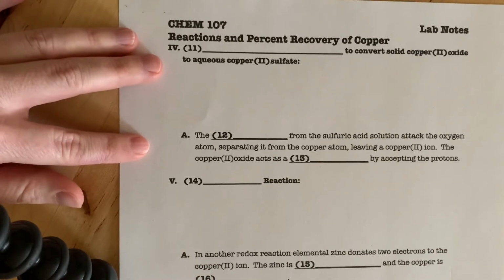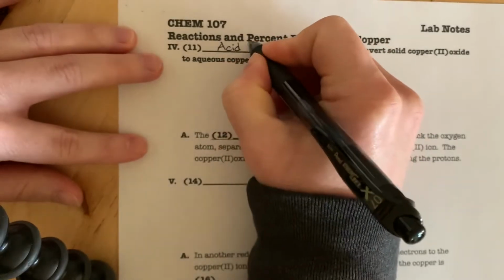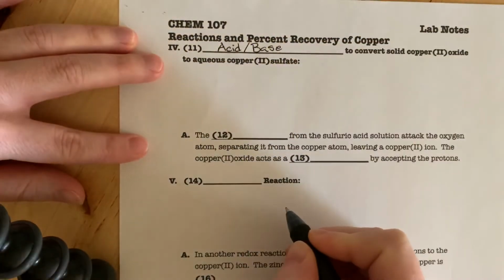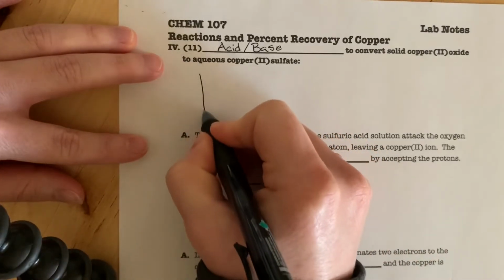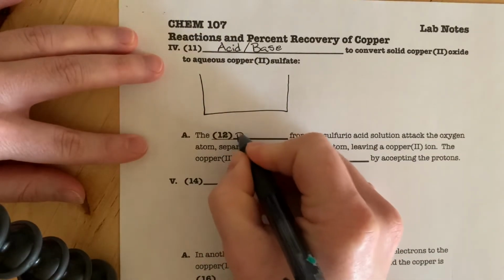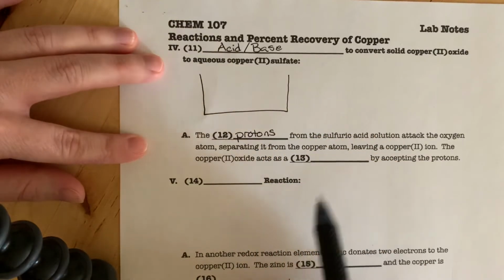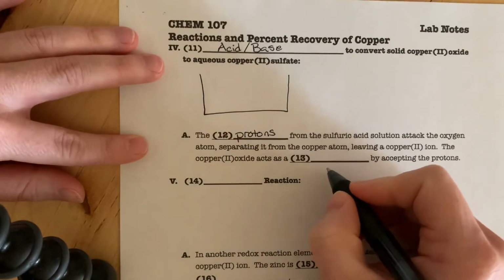Reaction 4 is an acid-base reaction. The protons from the sulfuric acid that you added are going to attack the oxygen in the copper 2 oxide, leaving the copper 2 ion in solution.